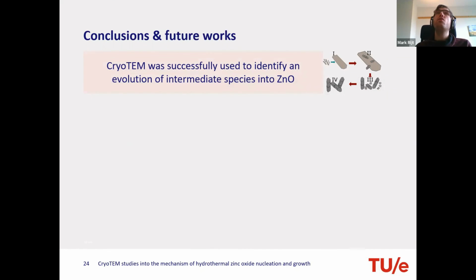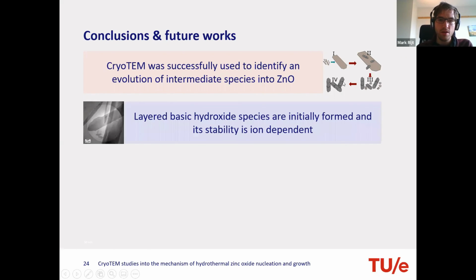So to conclude, Cryo TEM could be successfully used to probe the formation of zinc oxide from the initial zinc salts.